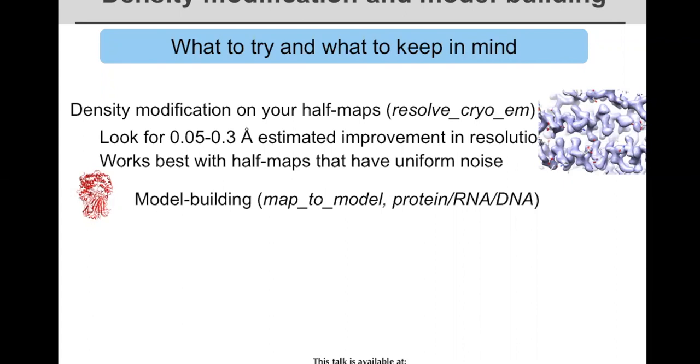So you can make a box around a point that you specify. You can make a box around a dummy set of atoms that you create. If you want to make a box, for example, that has a certain dimension, you can make a little PDB file that has a water in one corner and a water in the far other corner, and then that defines a box. And then you can do Phenix map box with that pseudo model in your map, and it will cut that piece out.